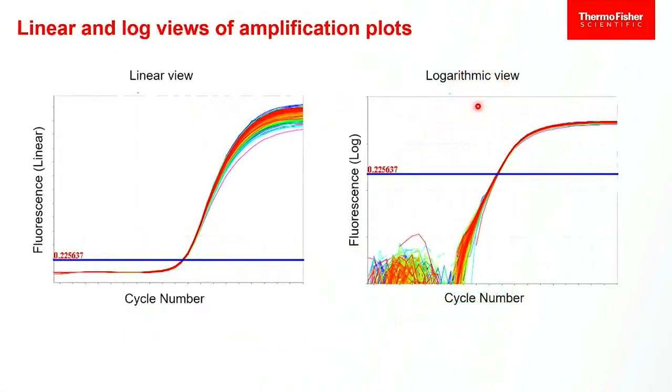When we actually do our data collection, because it's really hard to look at this point and say, what's the right place to put this threshold? Where do I actually want to gather that data? This is on a linear scale, so it's hard to see here, but remember, this is a twofold growth process.